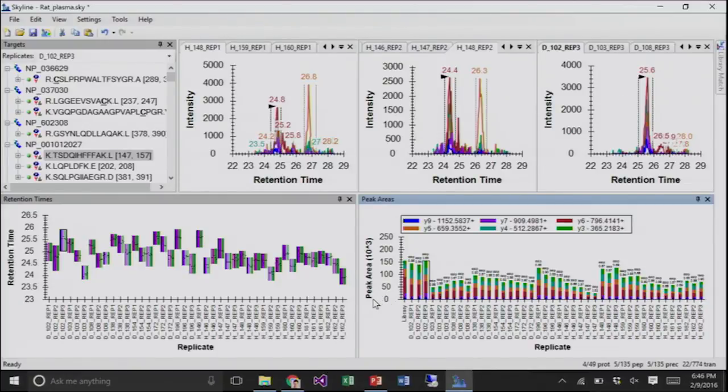Looks kind of weird, right? It's jumping around a lot more than we've been seeing. But again, I told you that these are not ordered in acquired time. Sometimes when you see really jumpy retention times, it may just mean that there was a systematic drift, and you just have them out of acquired time order.